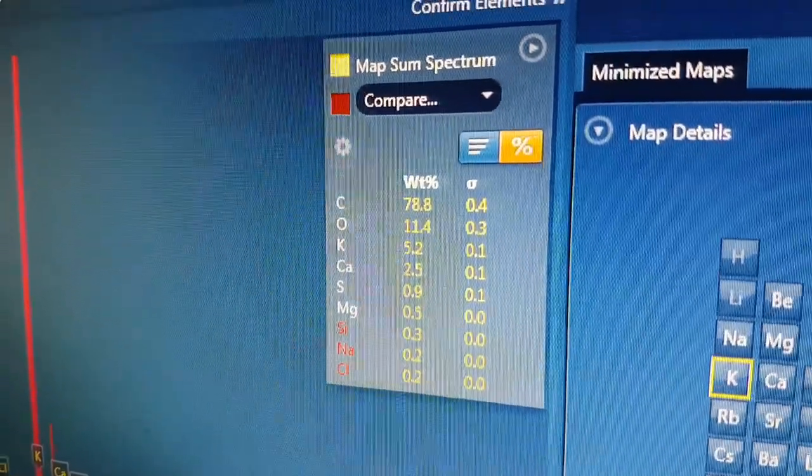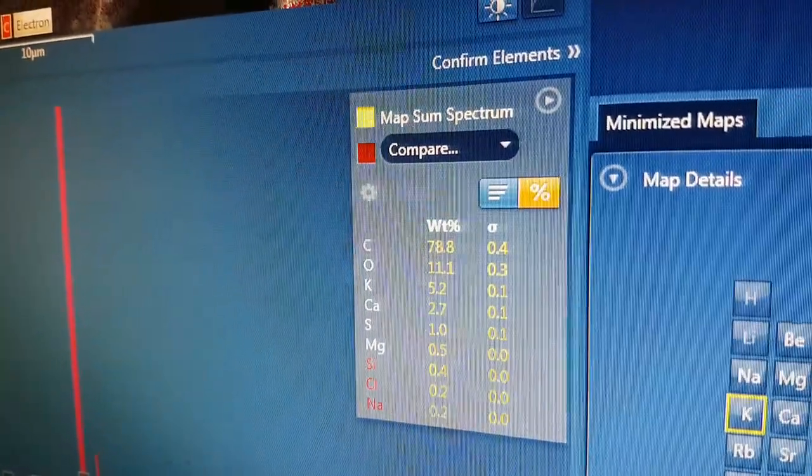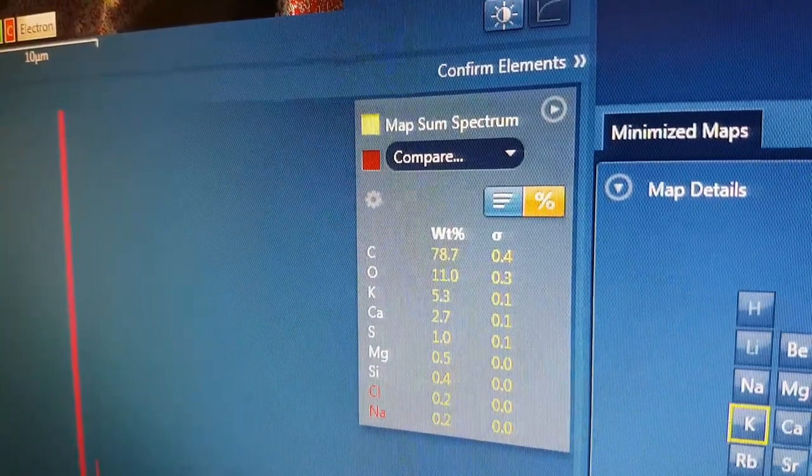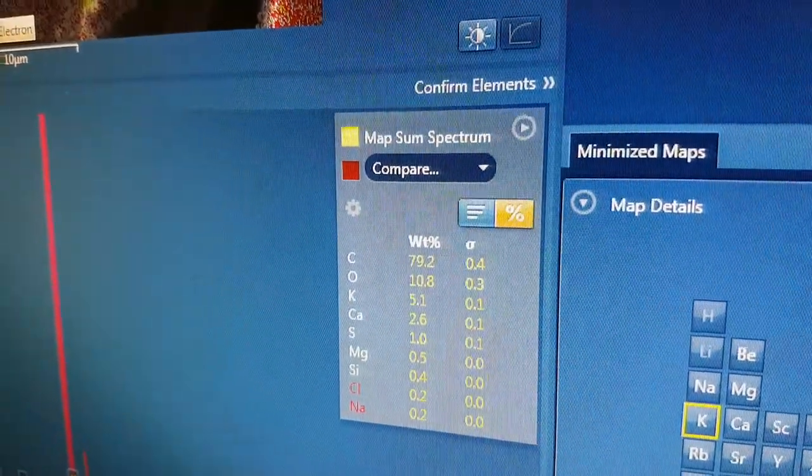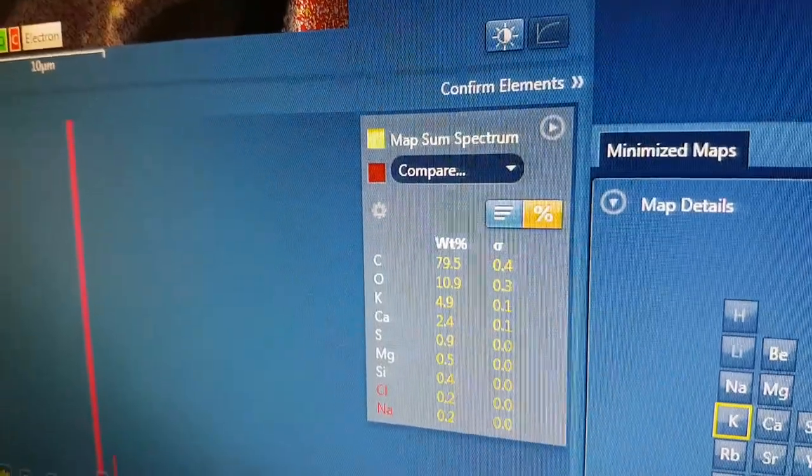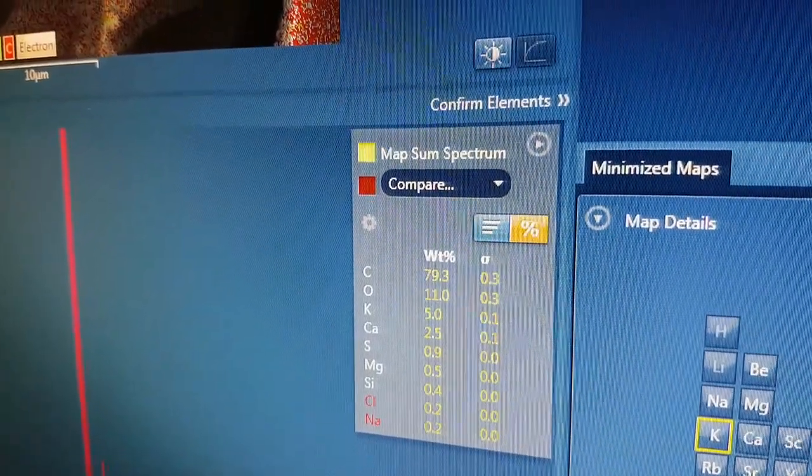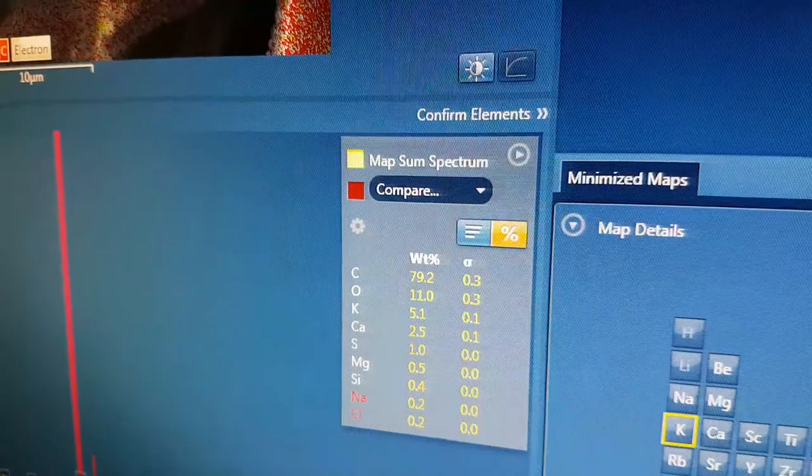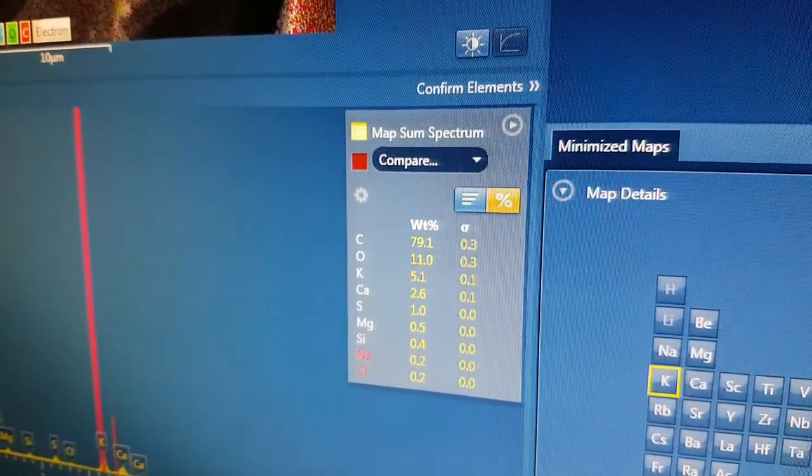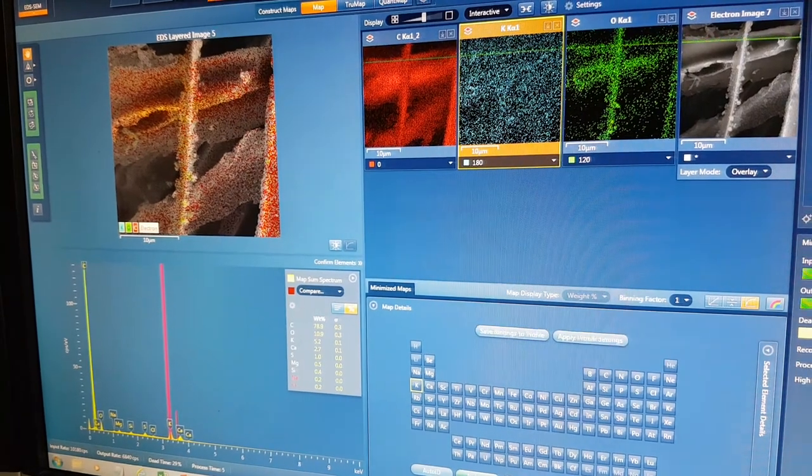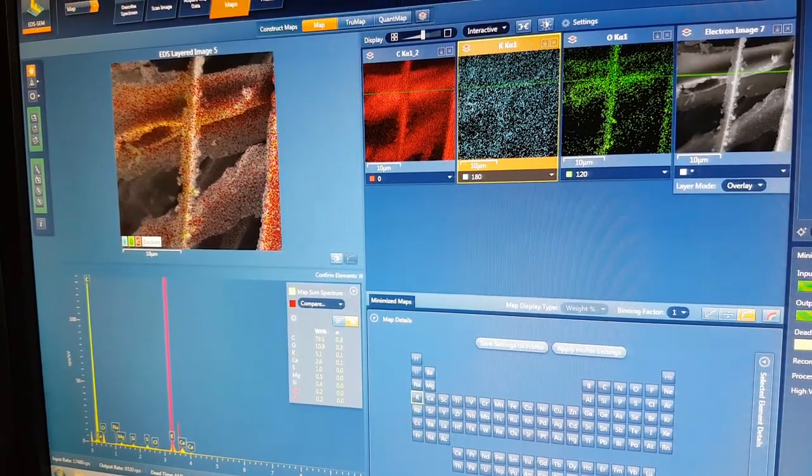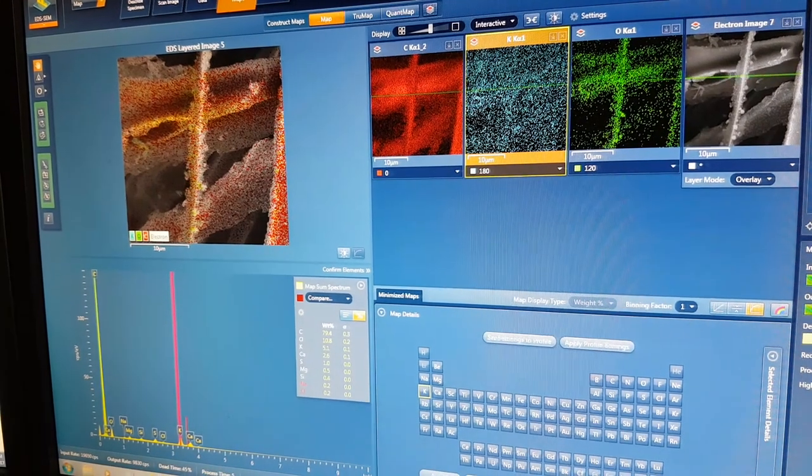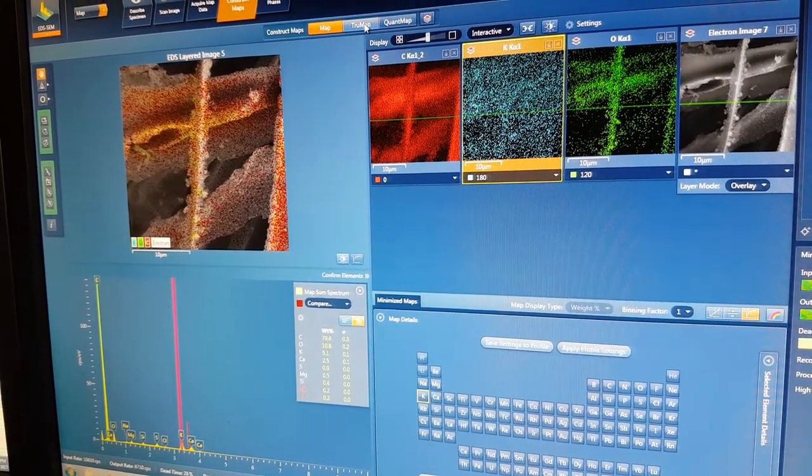The interesting thing is we're not seeing the iron. It's fine because this is in the front and this is behind. But we're not seeing iron. So, the extraction process with the magnet seemed to be fairly effective at least for this very rough first test of a two-minute run in the reactor.